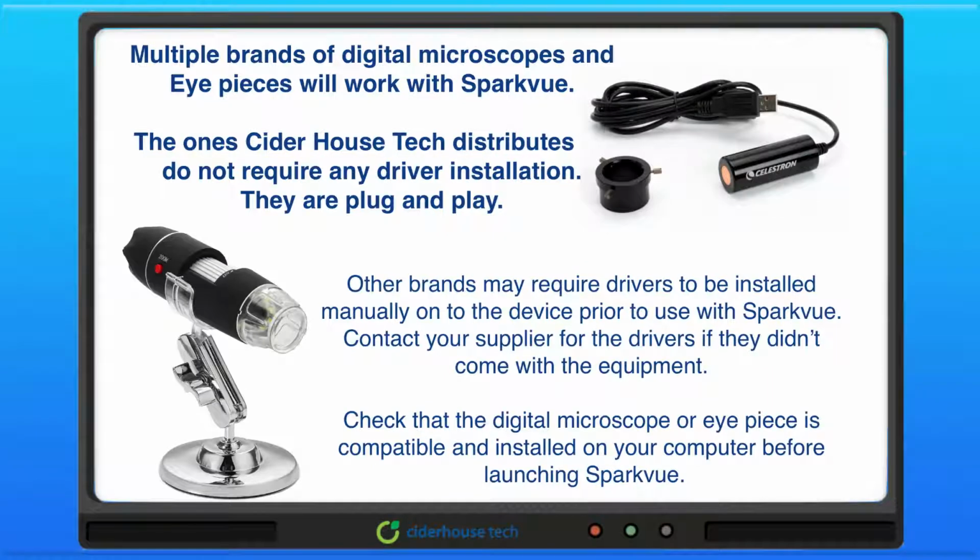Multiple brands of digital microscopes and eyepieces will work with SPARKvue. The ones Cider House Tech distributes do not require any driver installation. They are plug and play. Other brands may require drivers to be installed manually onto the device prior to use with SPARKvue. Contact your supplier for the drivers if they didn't come with the equipment.